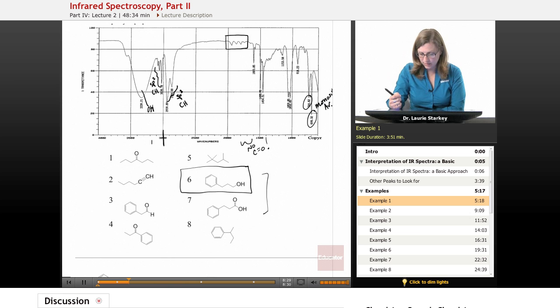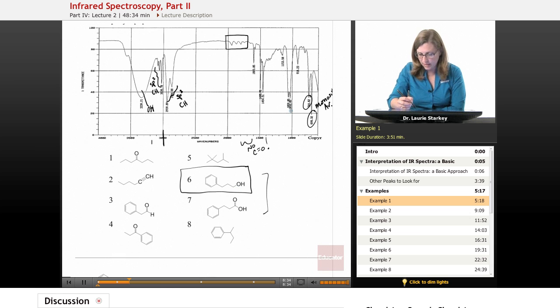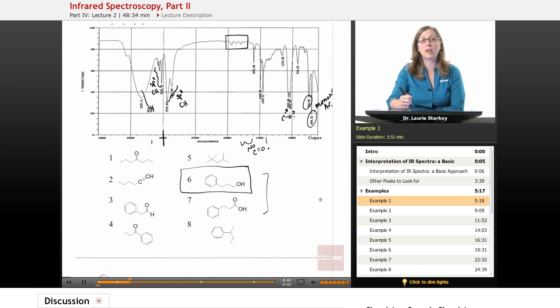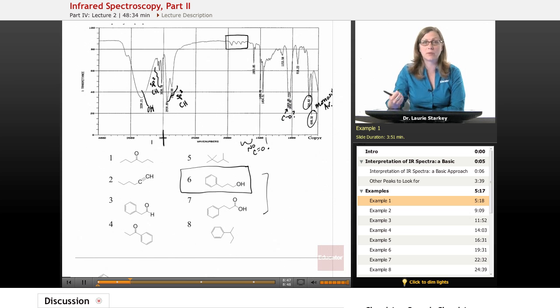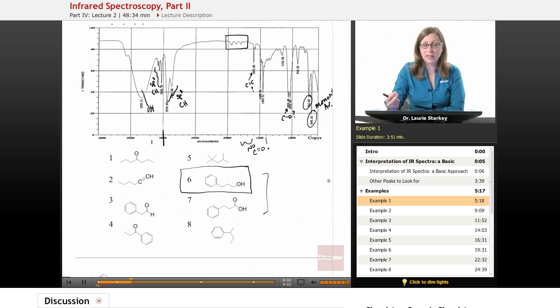Is there anything else? Maybe we could look for the C–O stretch — maybe one of these peaks is a C–O. There are two peaks here and I'm not sure which is the C–O, so we'll put a little question mark. Some things we're not going to be able to identify with certainty. Also, with the benzene ring, maybe this peak around 1600 is the carbon-carbon double bond. We could put a question mark there too — we'd expect to find something in that region, so it's probably a good guess.